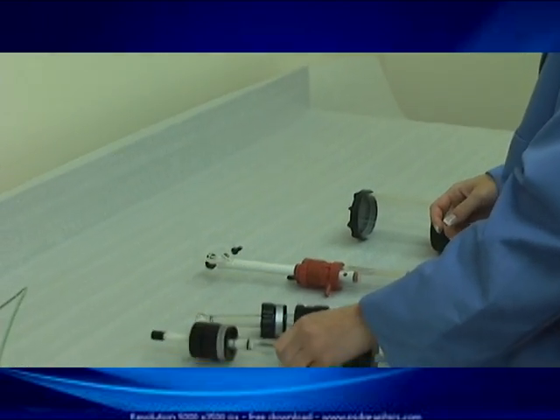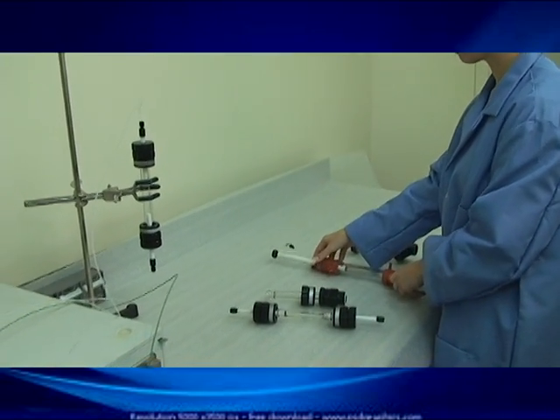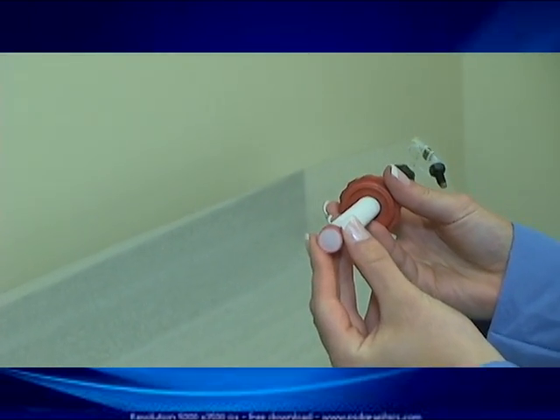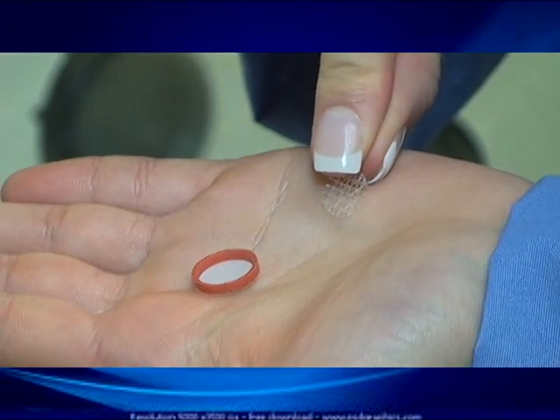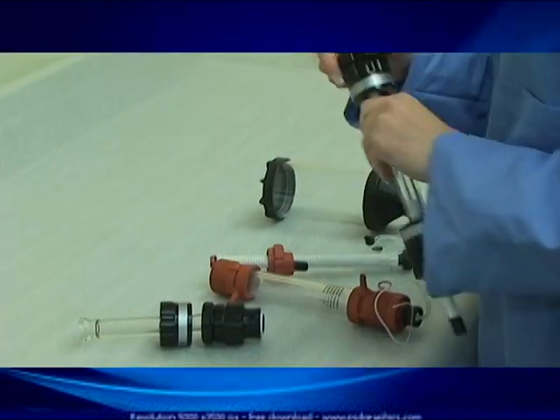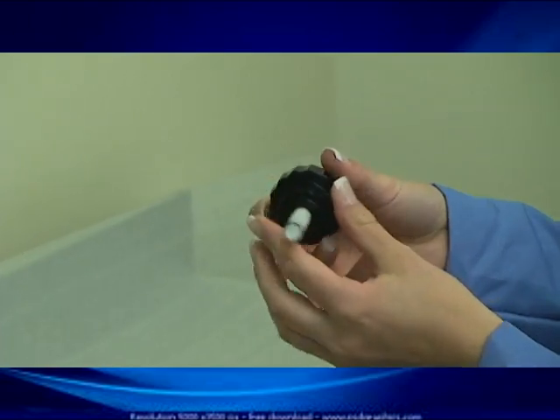Additionally, all ELS columns have a double piston configuration as standard. To get the double piston option with the comparative column, there is a significant upcharge. The next difference is the frit. On the comparative column, the frit is simply a nylon sock capped off on the end of the piston, with a plastic mesh behind it. This mesh does not allow for any flow distribution onto the packed bed, and the frits are prone to pop off during high-flow circumstances. The ELS columns, on the other hand, use what we consider to be a true frit — made of a porous material available in various porosities. Due to the thickness of the frit, as liquid passes through there is much greater flow distribution.